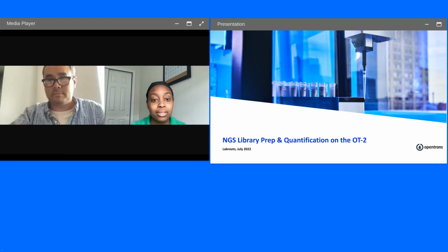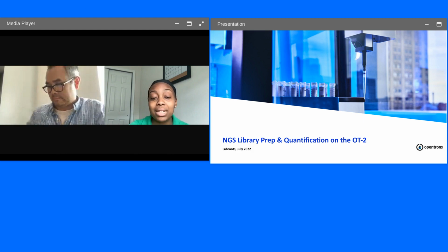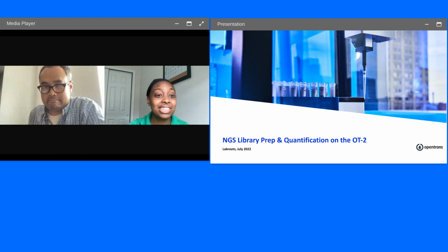Very helpful. So another question here, pretty specific. What should be the minimum concentration of bacterial genomic DNA for whole genome sequencing? Matthew, I'll lead the witness here. I'm hoping you can speak to different ranges of DNA templates that you've used in your experience with the OT-2 library prep.